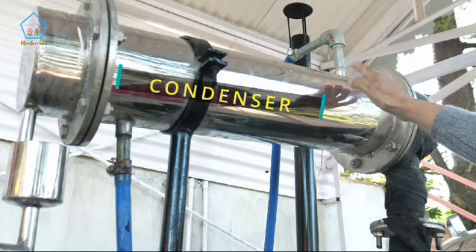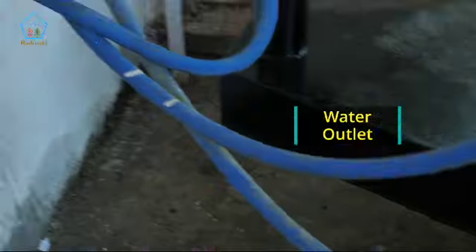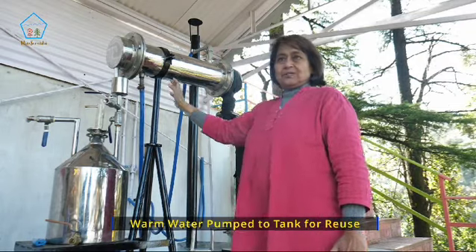The vapour is then going to be condensed because there is a flow of water here. This is the water inlet to the condenser and this is the water outlet from the condenser. After having condensed the vapour, the warm water is then pumped up to the tanks and then again it flows back into the unit, so there is no water wastage.